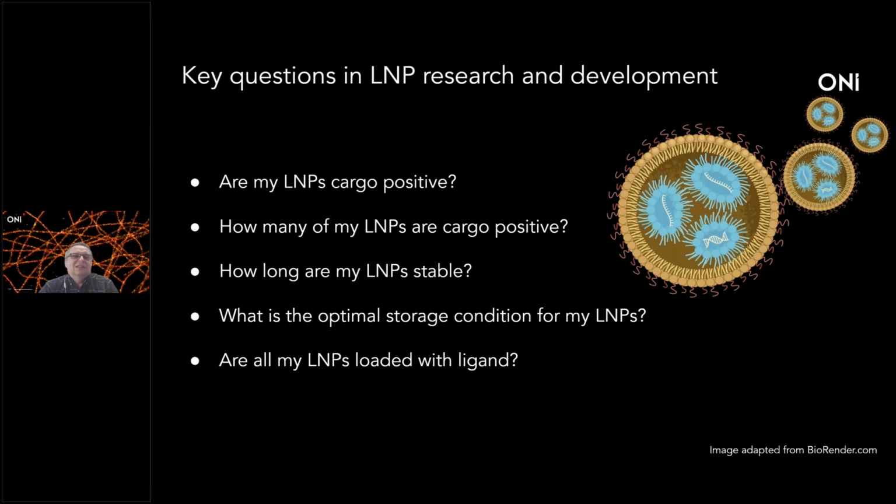So another question is, how many LNPs actually contain the cargo? You might have a lot of RNA within one LNP, but it doesn't mean that the majority of your LNPs will contain cargo. For efficient delivery, one or the other might be more useful.